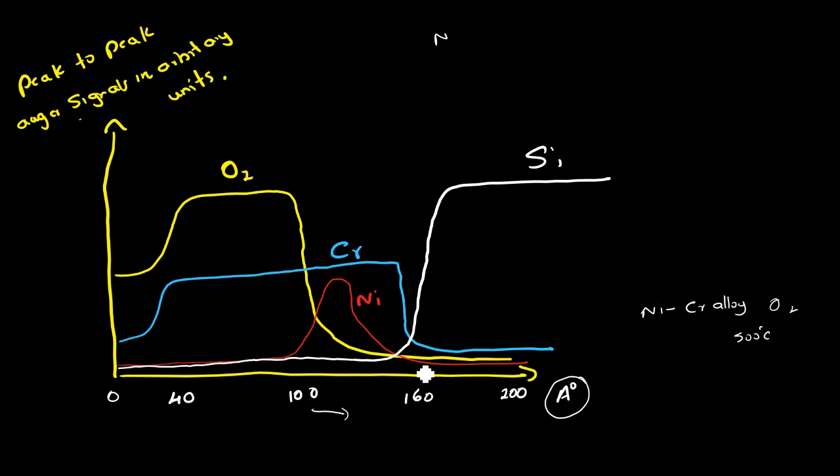So the first conclusion we can say is that after this particular process, the alloy reacting with oxygen has embedded oxygen in our material up to 40 to 100 angstrom in depth. Inside this depth, 40 angstrom to 100 angstrom, the oxygen is there. But after 100 angstrom in depth of our material, oxygen is no more.